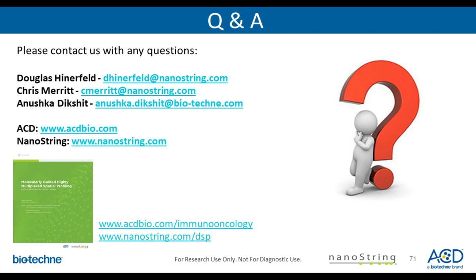Thank you. Okay, your next question. Can we use more than 2 genes for the ROI selection? Thanks for the question. Yes, we can do up to 3 genes for ROI selection as the first step in this workflow.